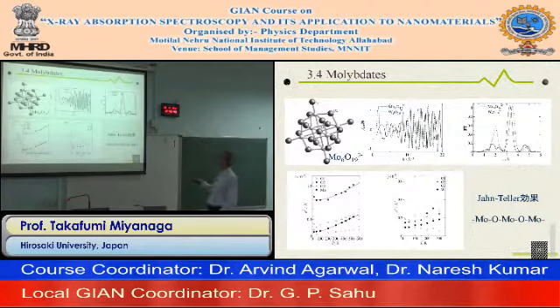Where are the nearest neighbor oxygens? So our analysis is here, the Debye-Waller factors. The Debye-Waller factor increases with temperature, but this absolute jump comes from the static distortions.